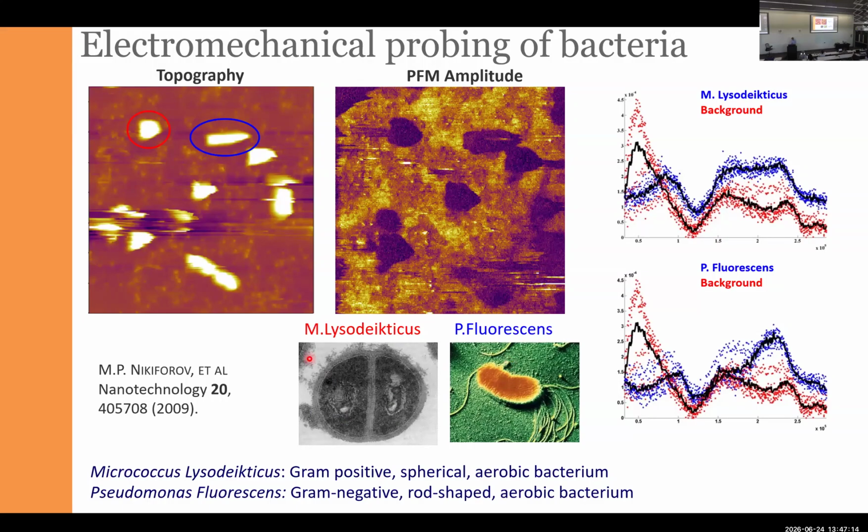So this is another example when we try to make the comparison between the data in the image plane and the data in the spectral plane. So imagine that we have some unknown objects. In this particular case, these are two different types of bacteria. And what we measure is a spectrum like this. So the equivalent from the STEM EELS would be the low-loss EELS, when we measure fairly complicated spectra without a clear physical model. So can machine learning become useful in these cases?